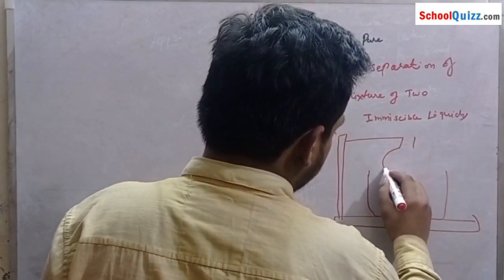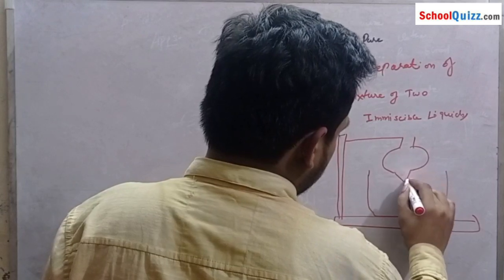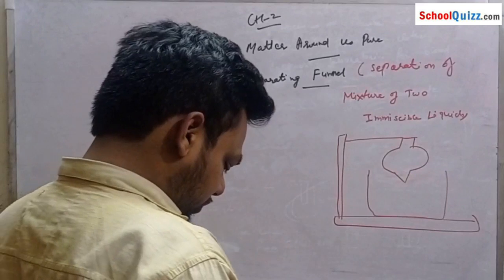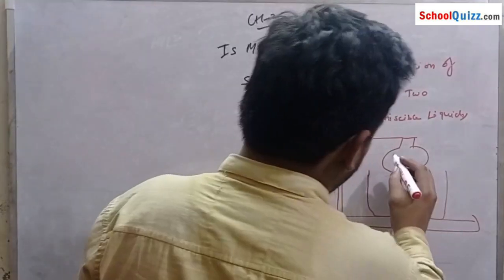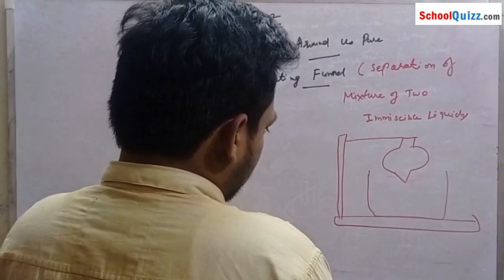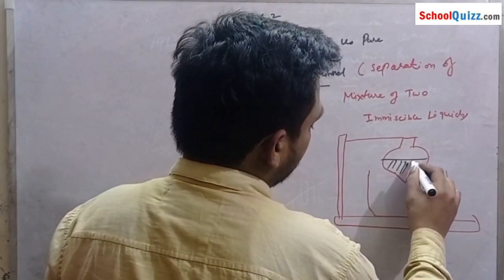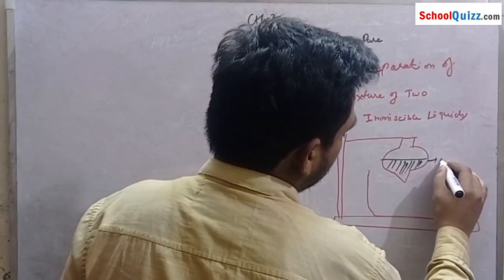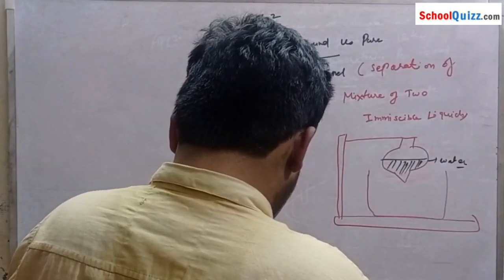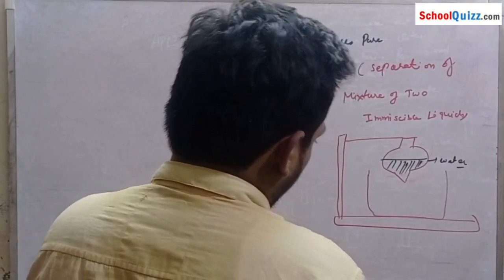In it we place the mixture: this is our water at the bottom, and the upper part is full of oil.